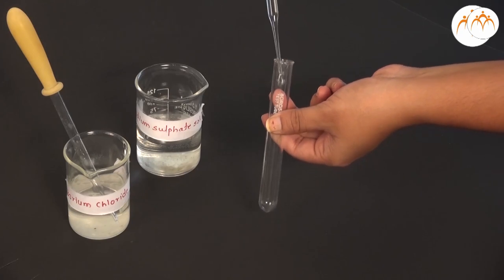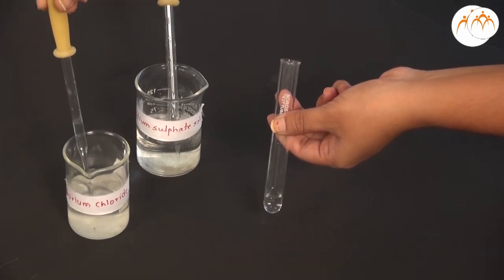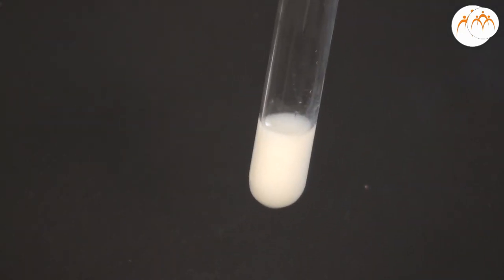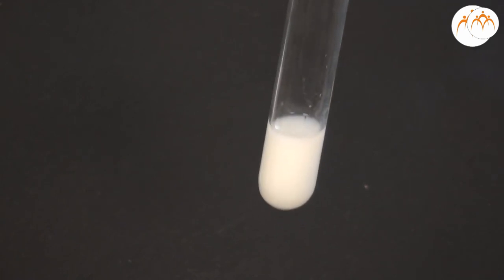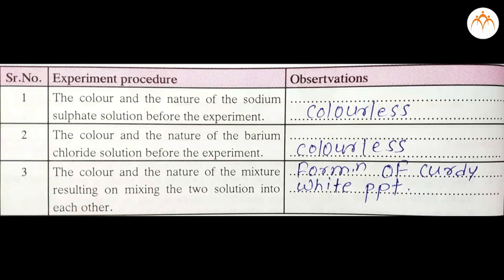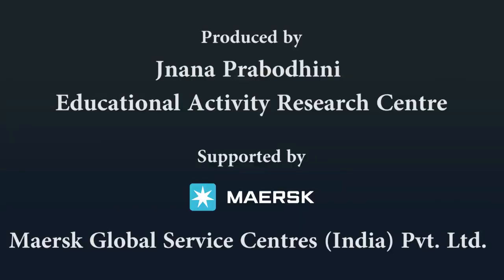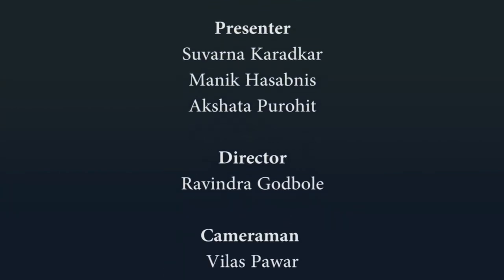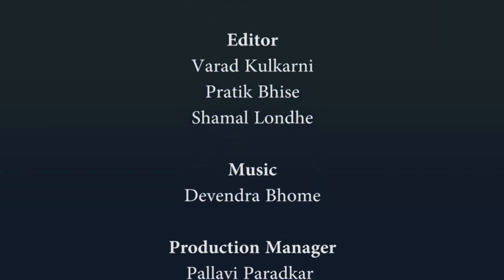Now take Na2SO4 in a test tube. Add BaCl2. After reaction, we observe white precipitate of barium sulphate. The compounds white precipitate of BaSO4 and colourless NaCl are formed by mutual exchange of ions. Therefore, it is double displacement reaction.